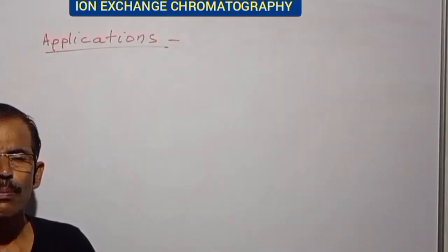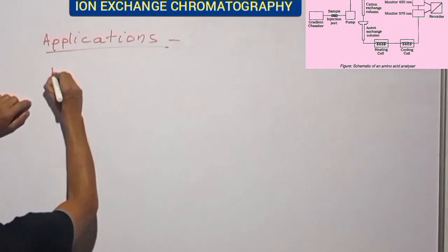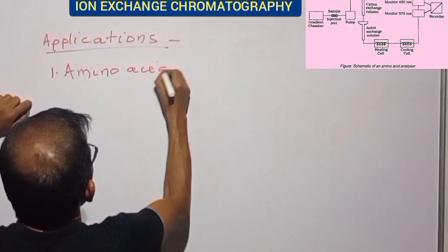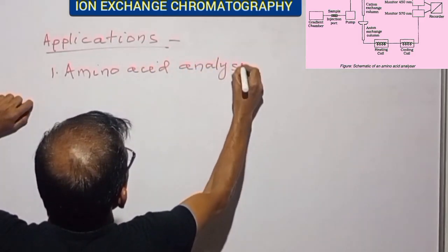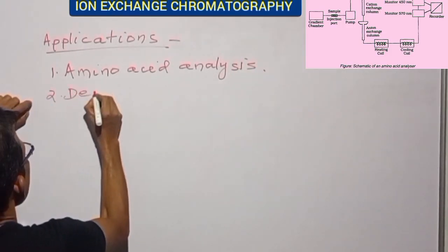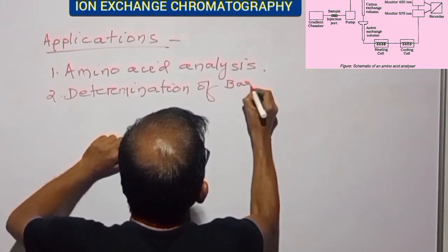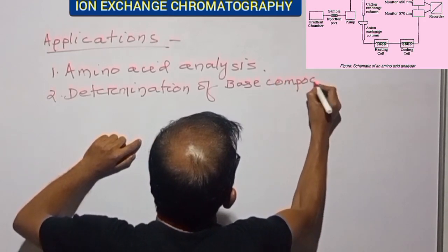Ion exchange chromatography has several applications such as amino acid analysis, determination of base composition of nucleic acids.